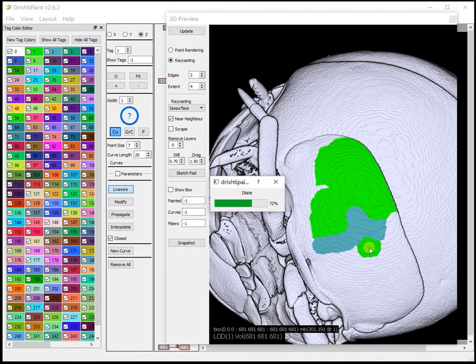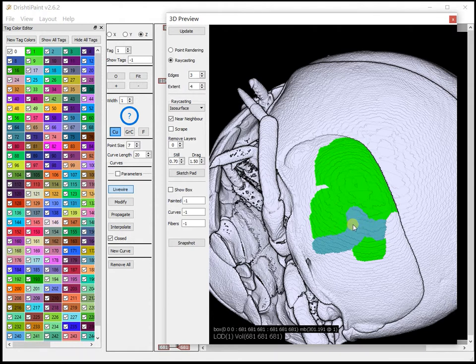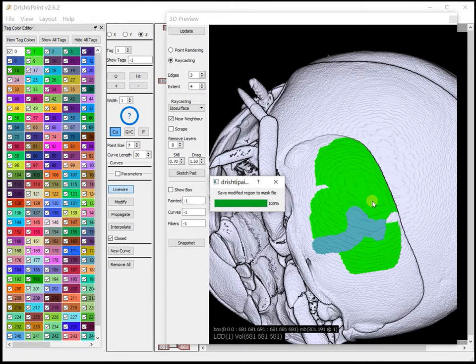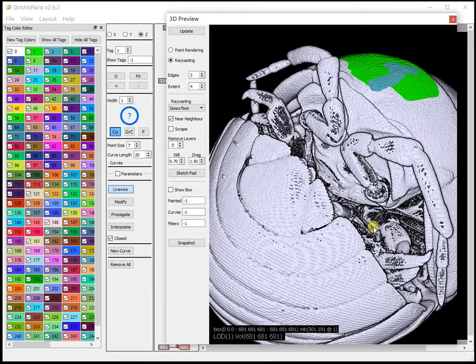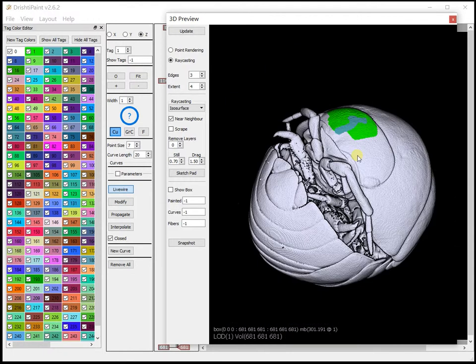then this dilated region will not penetrate the non-zero tagged region, and when these two regions connect, then that connected region will start dilating. That's when the connection has happened, and now both the regions will start dilating. That's when it happens.